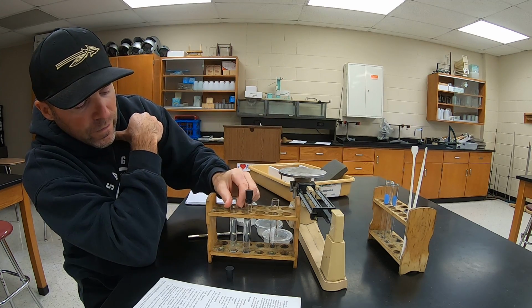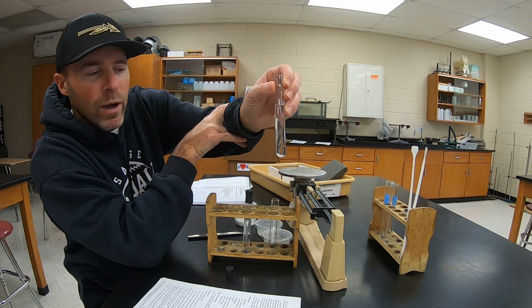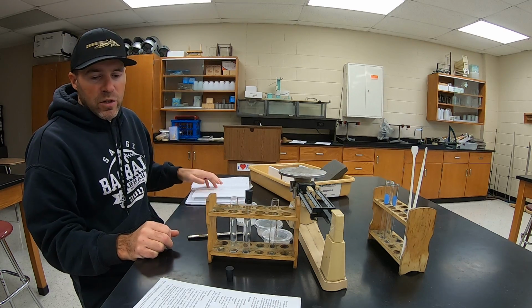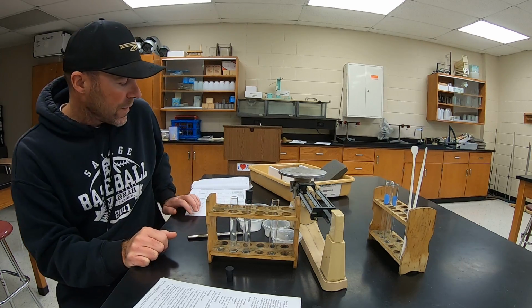And if you look in this one, which is the one we didn't invert, there's still salt in there. And we could probably wait here for several minutes, and you're still going to find that there's going to be salt in there. Probably, I don't know, 10 minutes, it might all dissolve after that point in time.